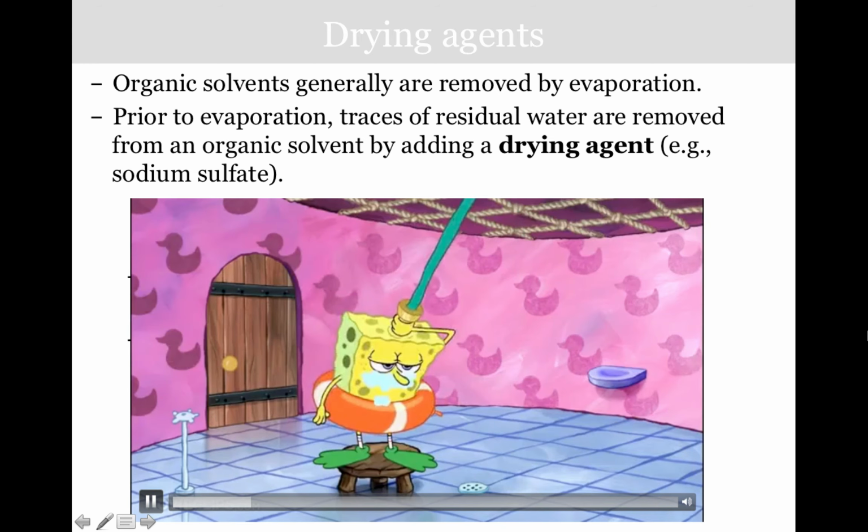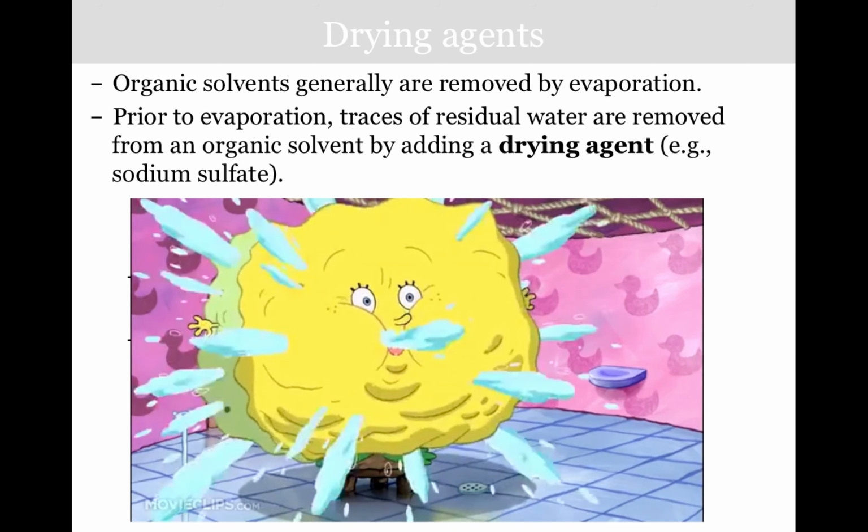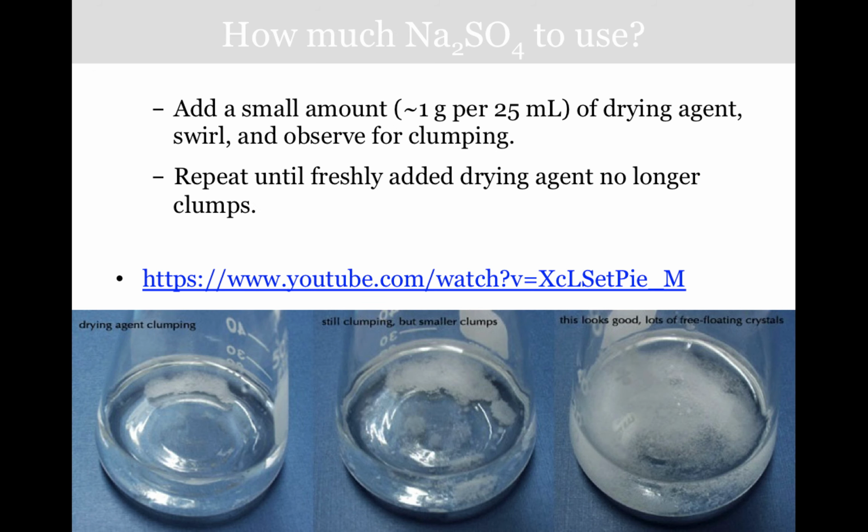Like a SpongeBob can soak up lots of water, drying agents act similarly, absorbing all the water from the organic solvent. It's an anhydrous inorganic salt and soaks up the residual water by forming a hydrate. They are not soluble in organic solvents and can be easily separated or removed by filtration. The most frequent question we get in the lab is how much sodium sulfate I should use.